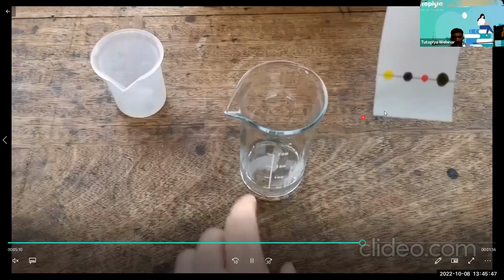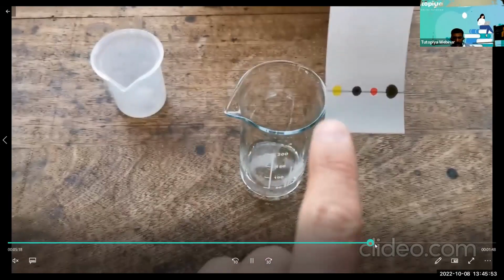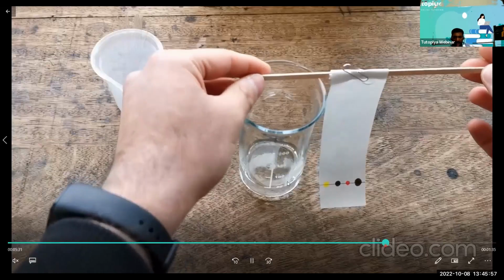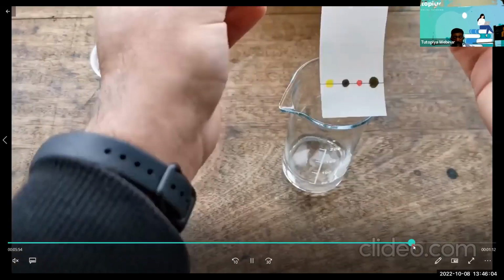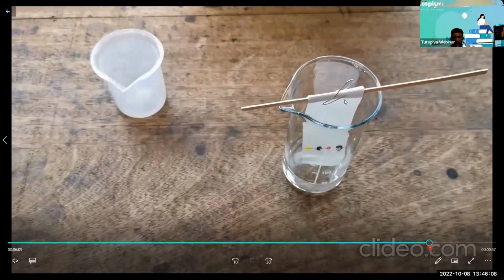Oh, it's going to dip into this. So you can remove some liquid, or you can fold this paper. I'll make a fold, one more fold like this, and just see. Oh, it's going to dip again. So maybe I'll remove some more liquid or make another fold. And now clip it and leave it for a couple of hours.